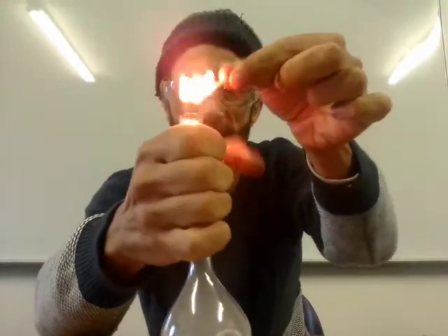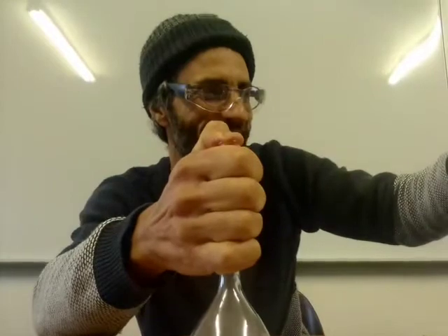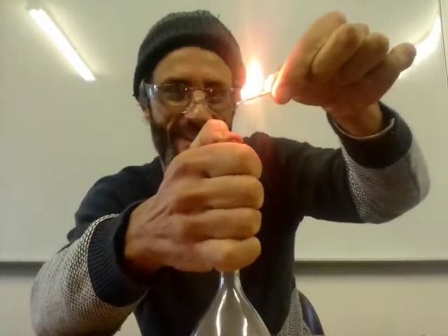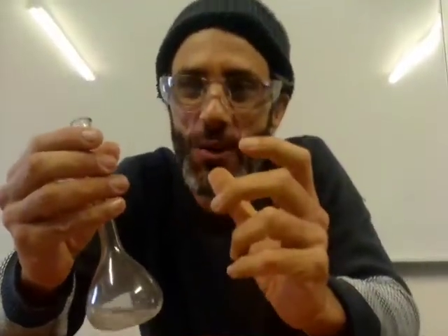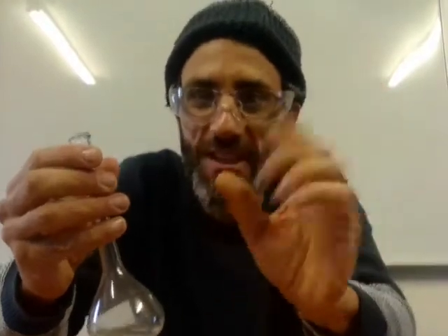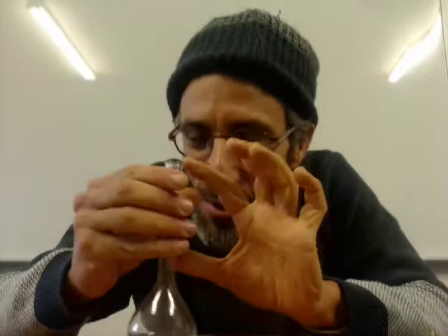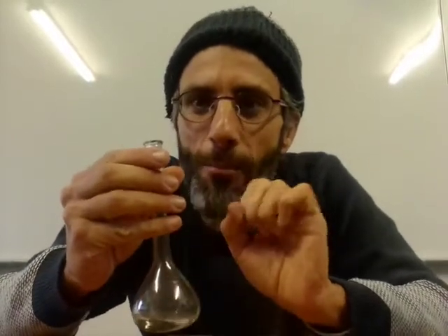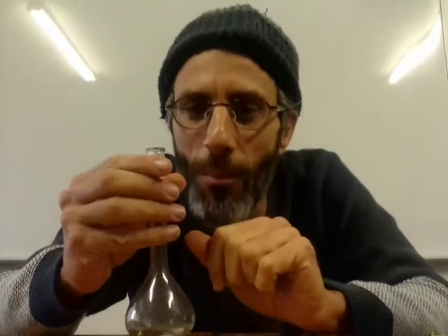So have a look at it. Okay, there's a bit of a fart in it. Okay, try one more time. Right, you probably saw that the flame just got extinguished, and hopefully you heard a little fart, like it just escaped from somebody. What will happen if I had the right tube, which is a little bit bigger than this, it should make a pop, a squeaky pop.